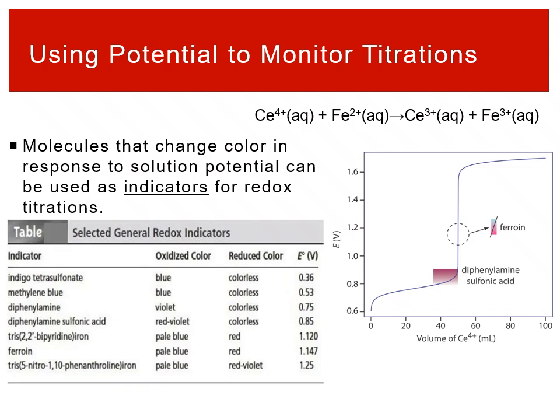And so just like we saw with acid-base titrations, when you're dealing with redox titrations, there are molecules that get affected by the redox chemistry and change colors if they're oxidized or reduced. And so you can use different molecules that cover different ranges, changing color at different potentials. For example, diphenylamine sulfonic acid changes colors at 0.85. It goes from colorless to red, this reddish purple color. So you can see down here, your solution, this sort of fade is indicating colorless. And then basically, you've hit the equivalence point when it goes to red.